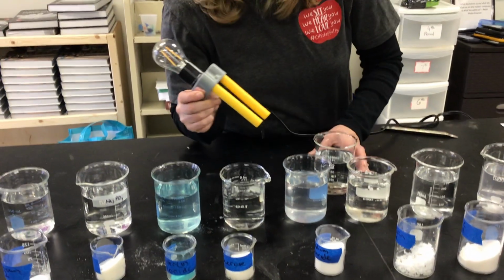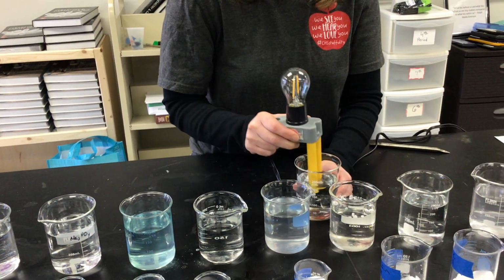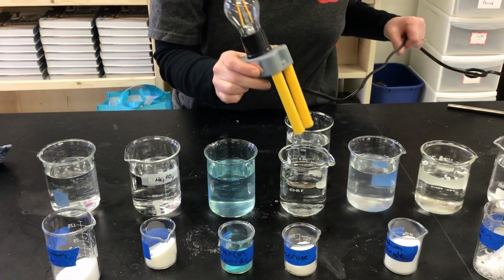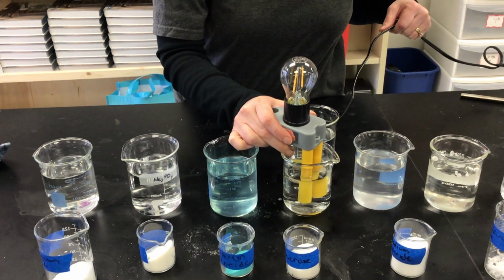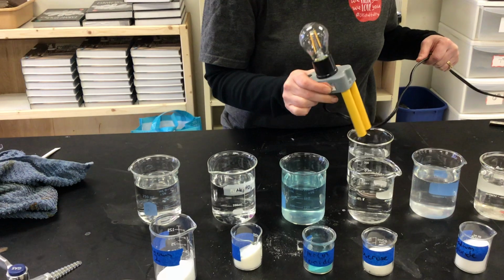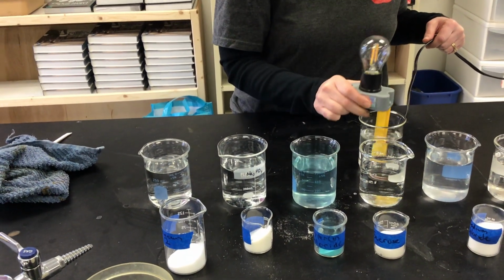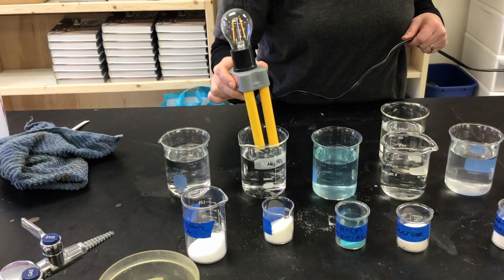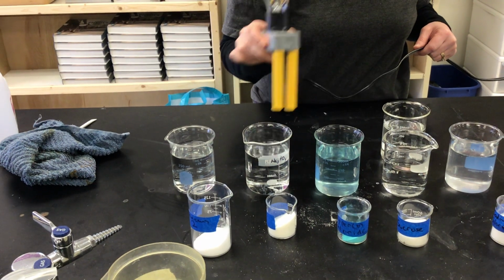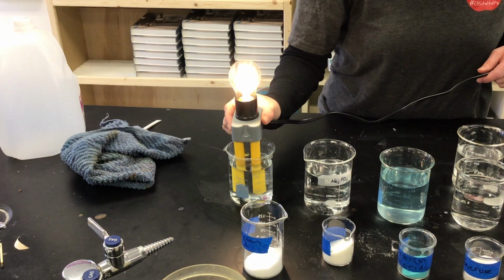Next is our sodium chloride. Woo. It's very bright, very bright. Okay, next is my sucrose. All right, nothing happening there. Next is my copper chloride. And next is my unknown number 1. Nothing. And last, this is my unknown number 2.